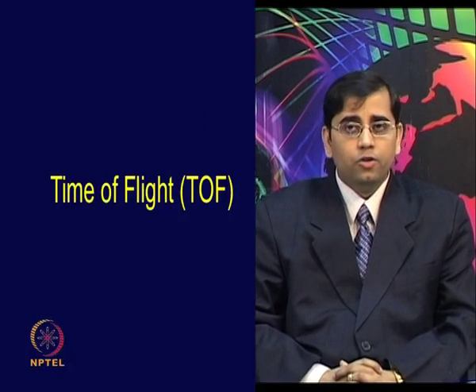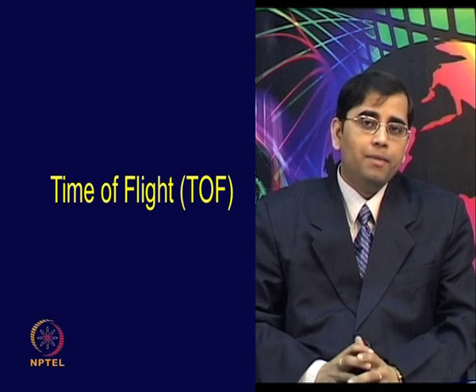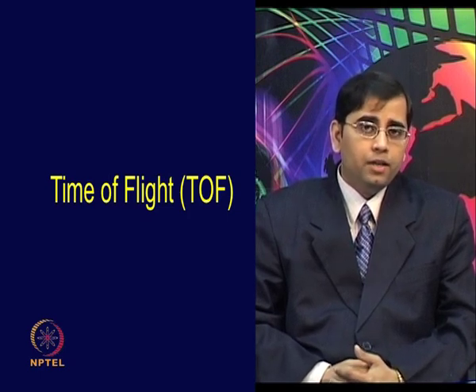Now, let us discuss some of the important mass analyzers in a little more detail. First, let us talk about time of flight, which is one of the simplest mass analyzers currently used in combination with MALDI. The TOF has emerged as one of the mainstream techniques for the analysis of biomolecules, and it is widely used for various applications.